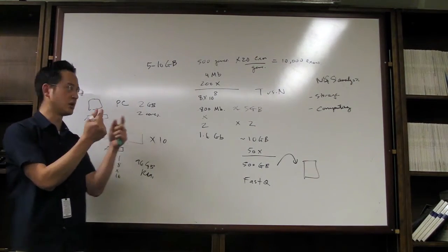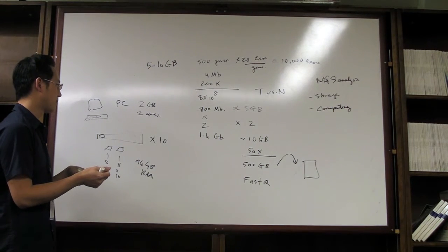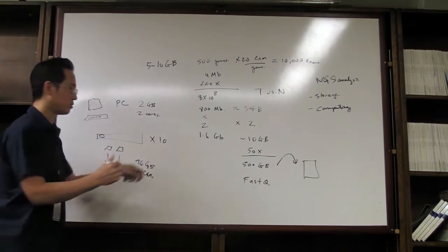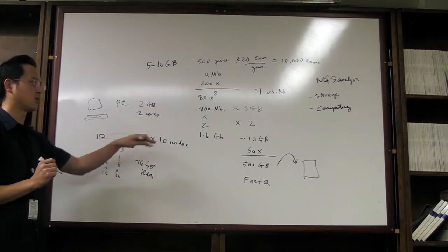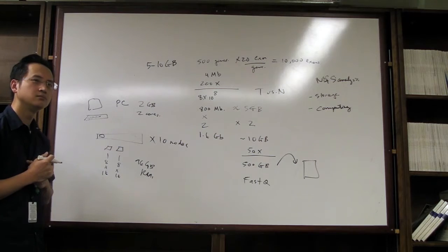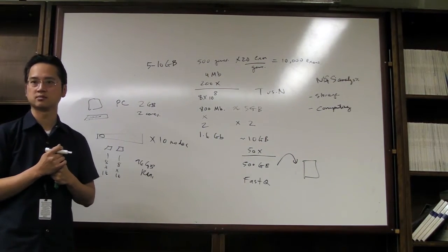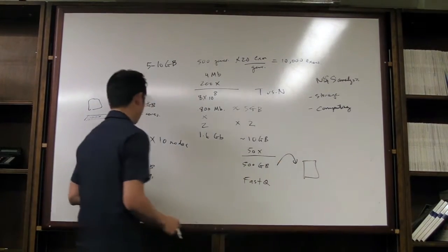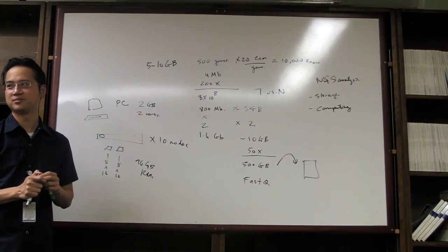So they all stitch together so that they share sort of the same processing power. You can distribute jobs across the different nodes. So this will be 10 nodes. Each one will be a node here. And this will cost 100,000, 150,000 to get that amount of computing capacity. So this is just computing, by the way. So that takes care of that portion. So you have that in the budget? Yes, you would definitely need that in the budget to make this work.